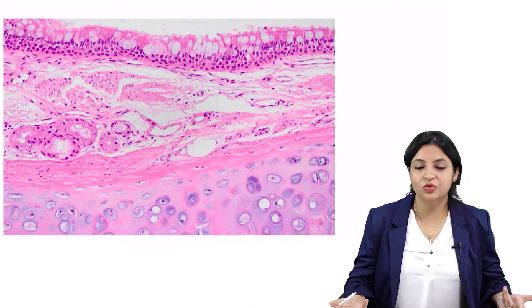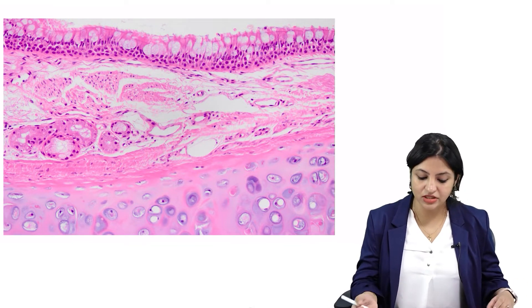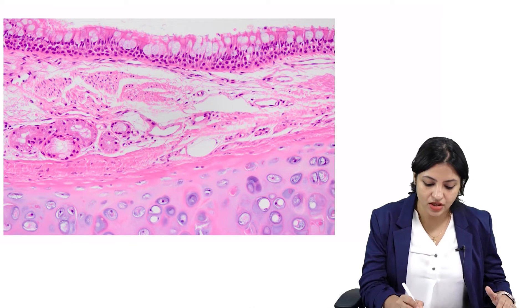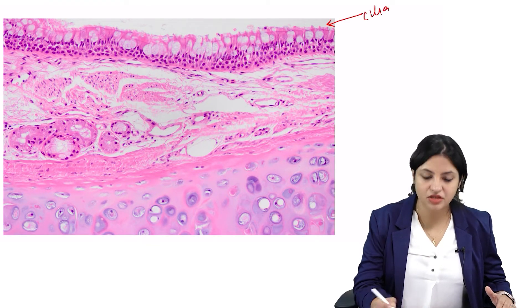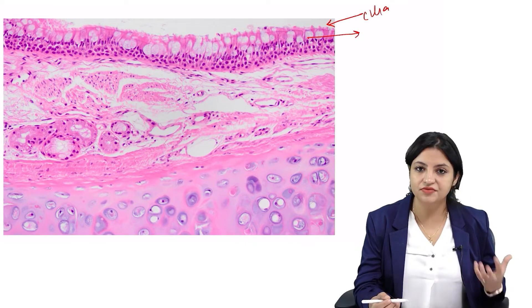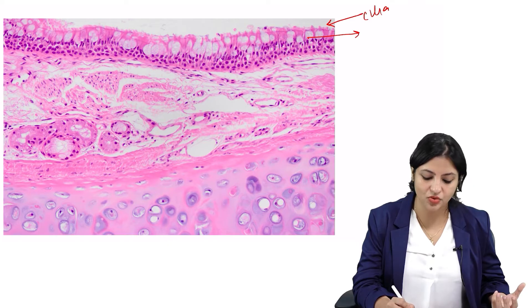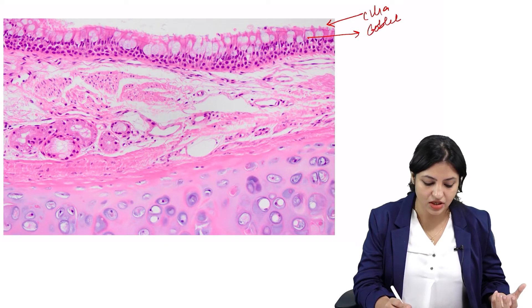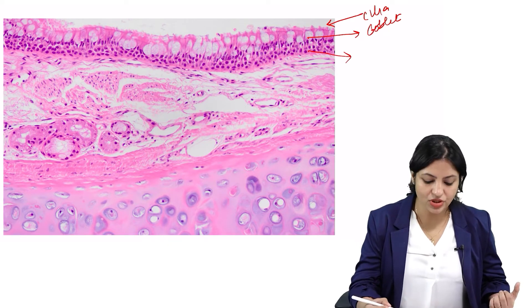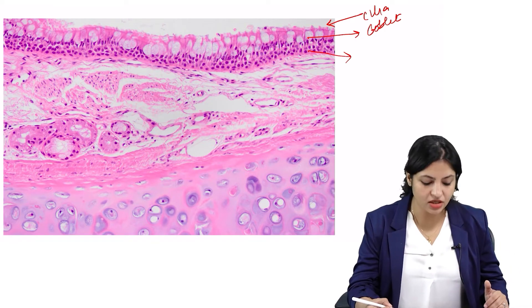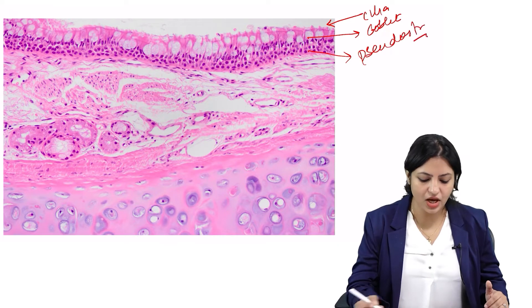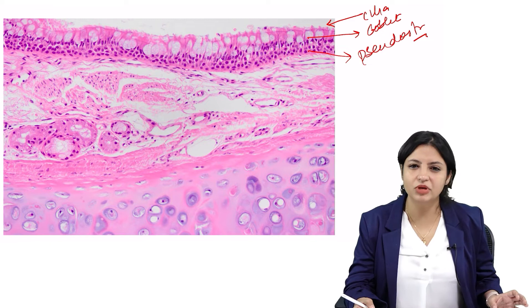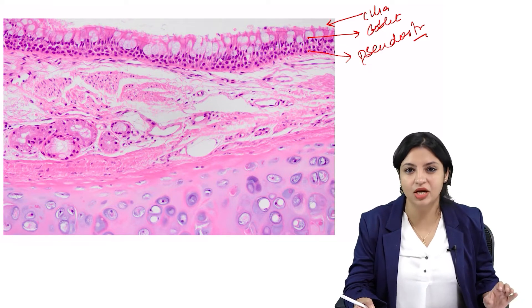Let's look at one histology section and try to identify it. I can see cilia on top, and some big glands filled with blue-colored mucus — could those be goblet cells? Looking at the epithelium, the nuclei appear at various levels, so it looks like a pseudostratified epithelium. So this is probably pseudostratified ciliated columnar epithelium with goblet cells.